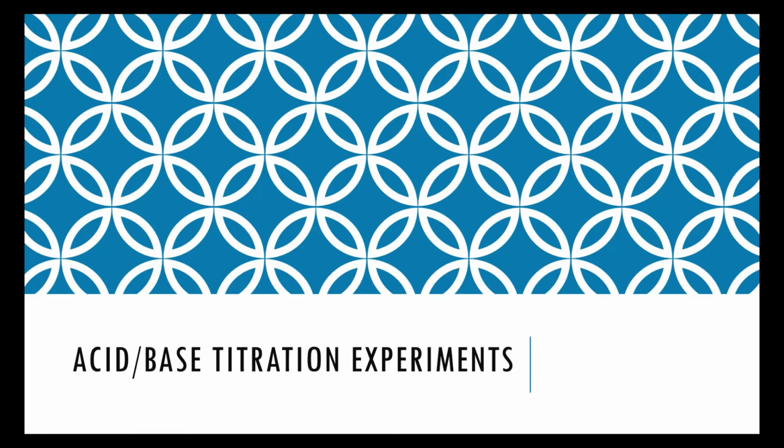In the second titration, you're going to be generating a titration curve of phosphoric acid with sodium hydroxide.